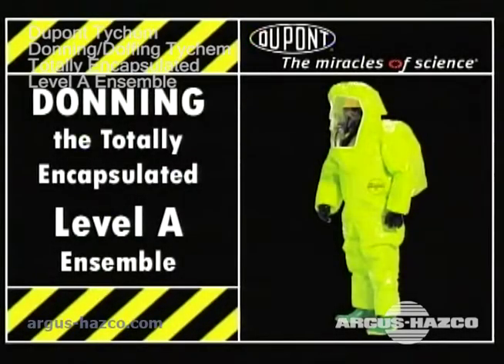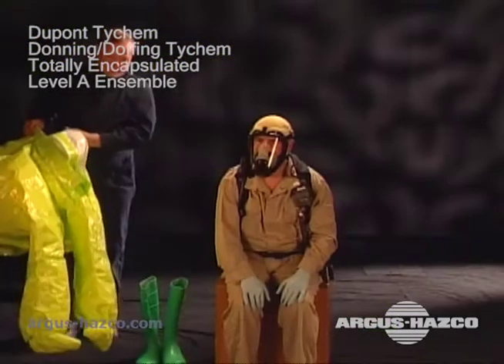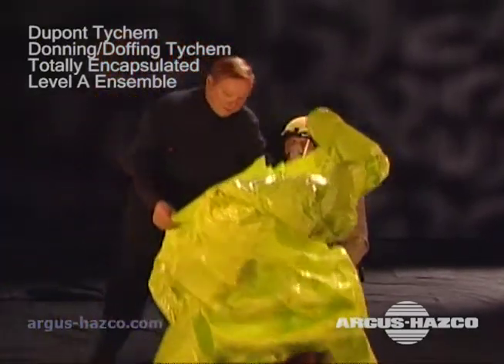Donning a DuPont Tychem Level A suit starts with a thorough inspection. Refer to the first section of this program for inspection instructions. Before donning the suit, let's start with a few reminders.